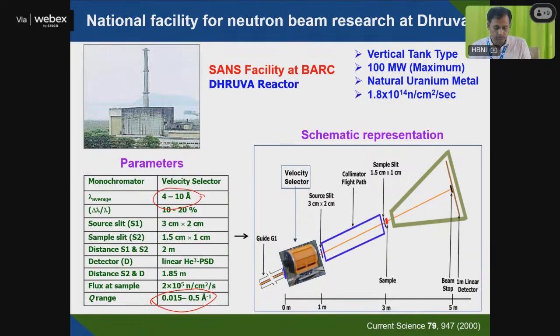Okay, so I will now discuss another technique, neutron diffraction, that I could not cover in the last class. As I told, I discussed X-ray scattering and neutron scattering, and similarly I have discussed X-ray diffraction. This other one is neutron diffraction. Neutron diffraction also satisfies Bragg's law, and diffraction occurs. So we will discuss neutron diffraction right now. I'll just share the other PPT to discuss it.